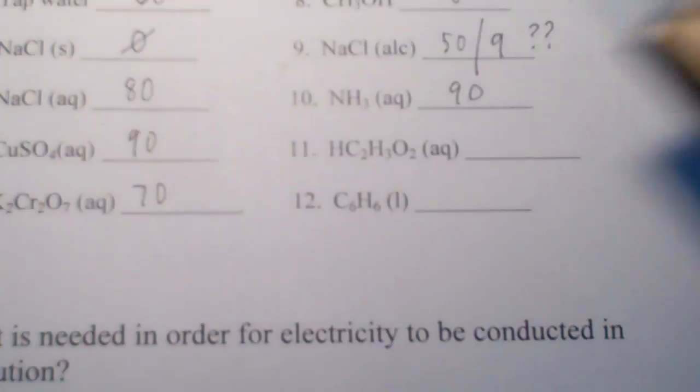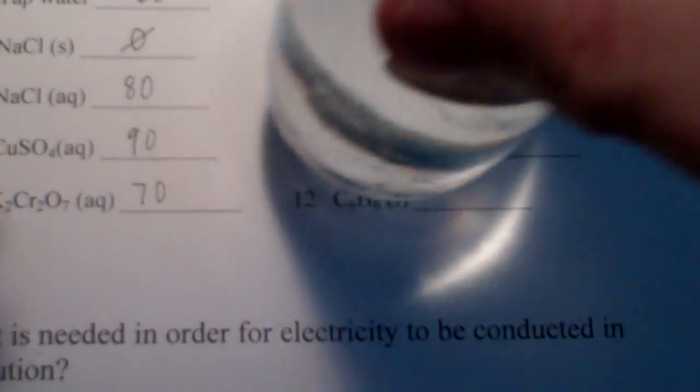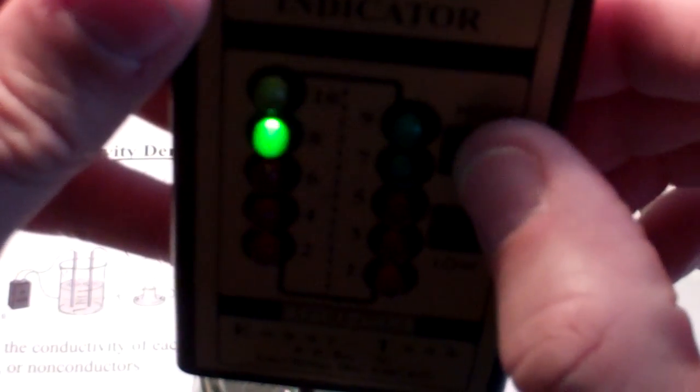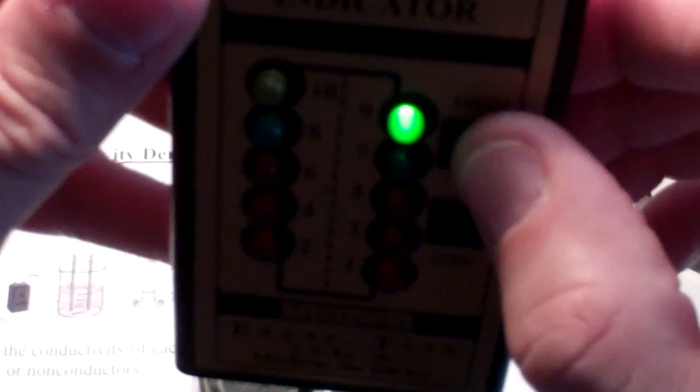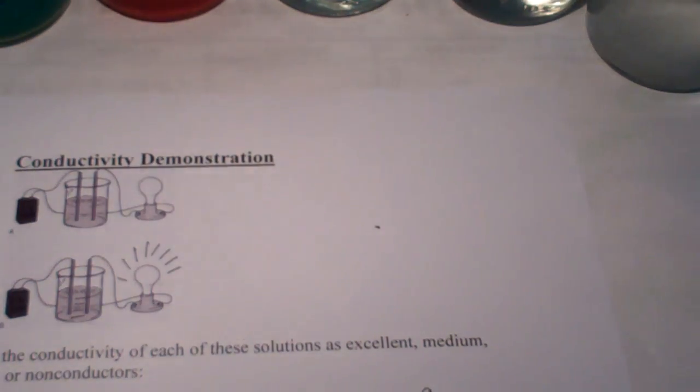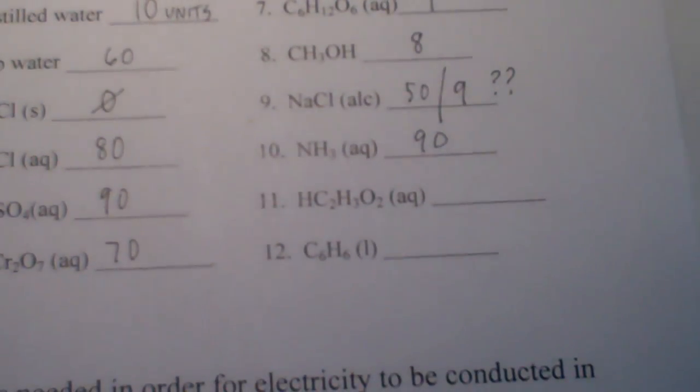Next up will be acetic acid. So, the acetic acid I'm using is actually just some white vinegar. We'll put the conductivity meter in there. Press the low setting. 10 plus. The high setting. That's up to 90 just like the ammonia was. So, that must have some ions in there as well. So, we'll record that as 90.